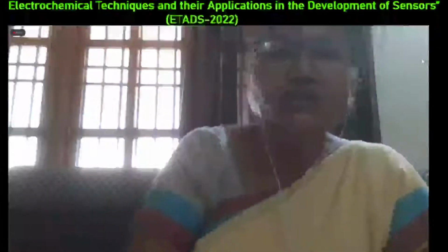We have to control the time. Yes, time and potential are very important parameters for this as well. You need to optimize the potential depending on the electrode support that you use, because the overpotential of the formation of OH minus is different from one electrode surface to another. If you would like to avoid the optimization of this applied potential, you can use galvanostatic conditions.